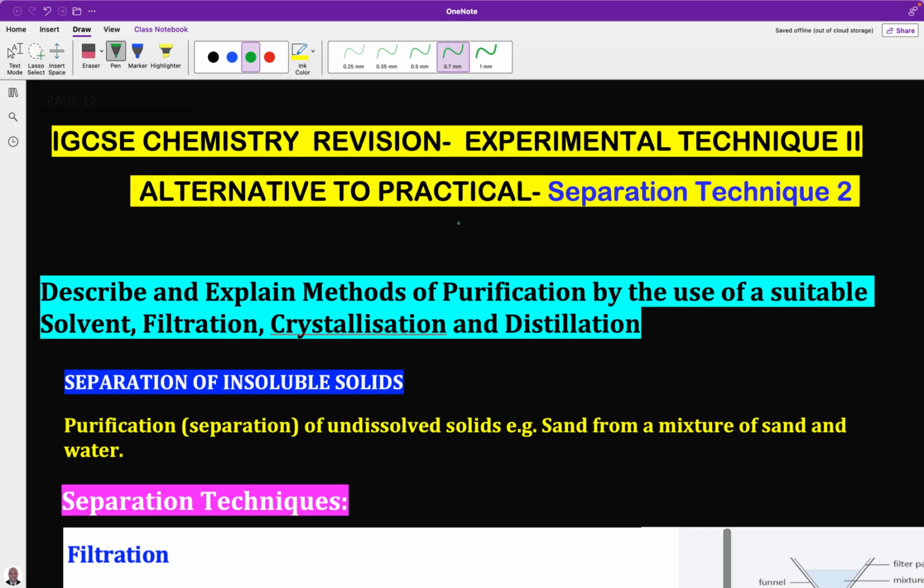And finally, we can now use the differences in the properties to choose our method of separation. For instance, we use the difference in solubility to choose a suitable solvent as we did in paper chromatography. We will also use the differences in the boiling point of liquid to choose the distillation apparatus, just to mention a few of these ones.